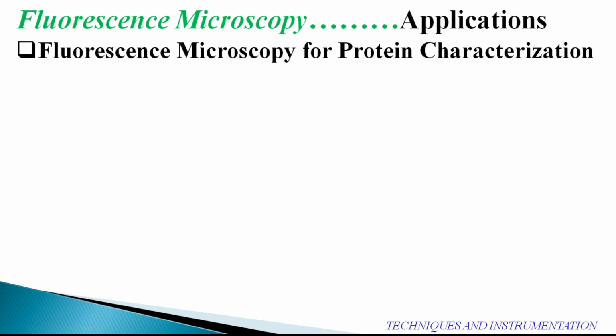So as I say, the intracellular dynamics is a little bit complicated, either working in the form of an enzyme or catalyst, or as a stimulating substance or stimulating response in fact. So in different ways these proteins behave, which indicates the intracellular dynamics of protein-protein interaction. It is very difficult.